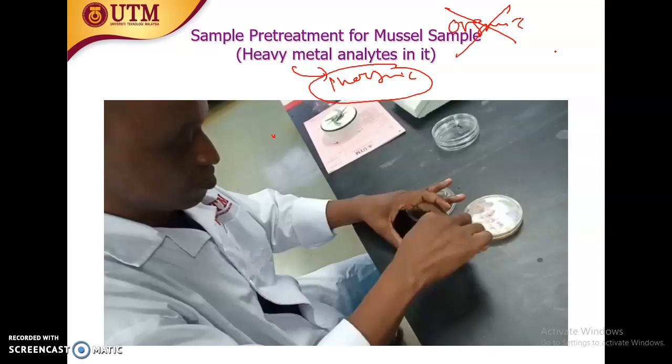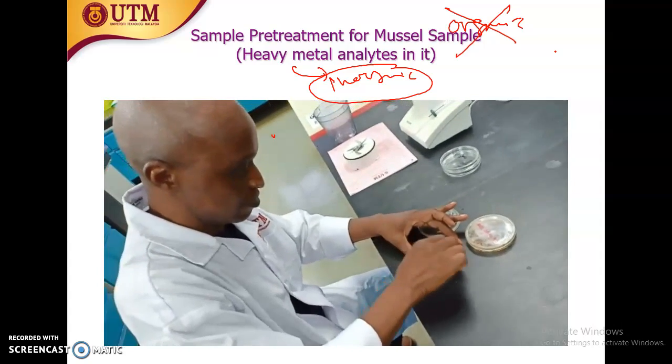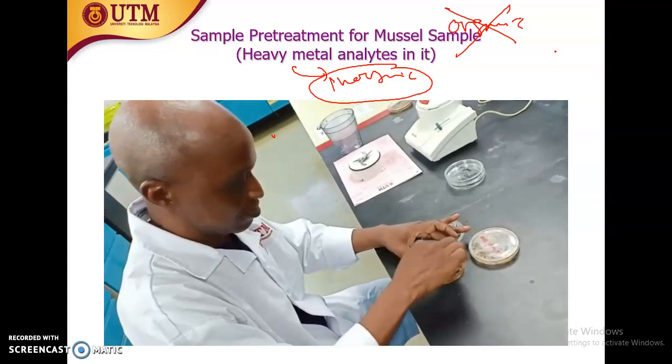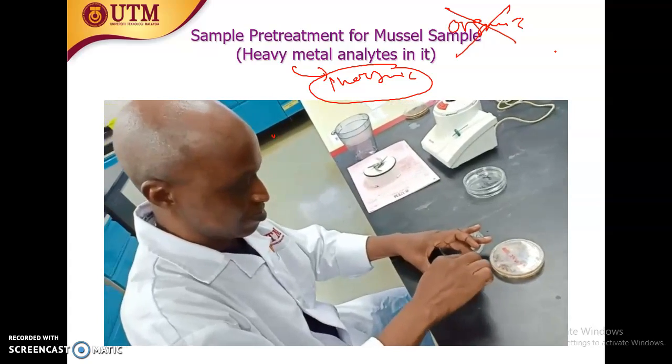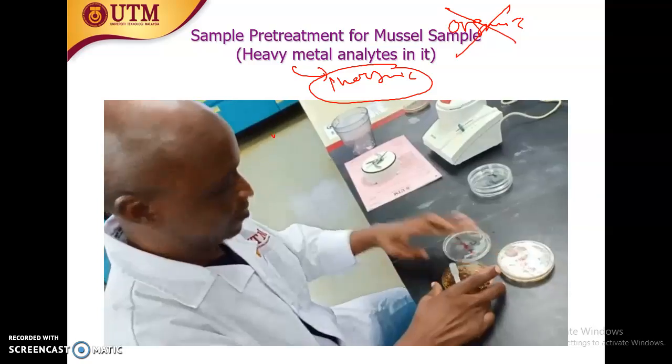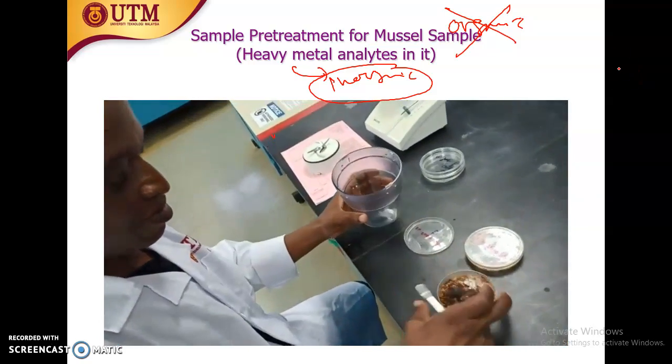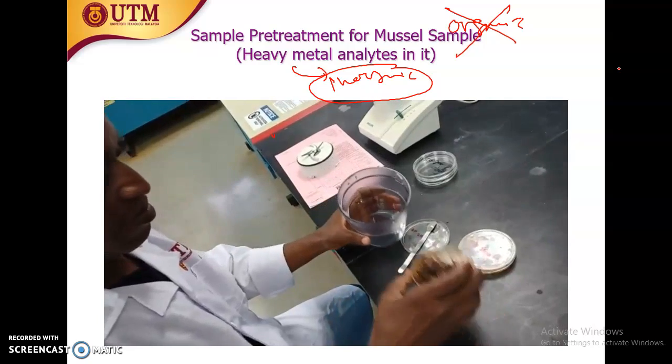So this is where he actually grinds together with the spatula before he blends it inside the normal kitchen blender.